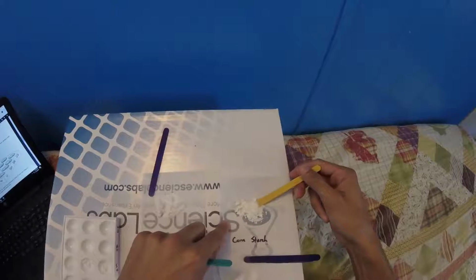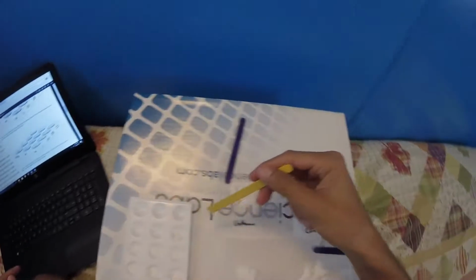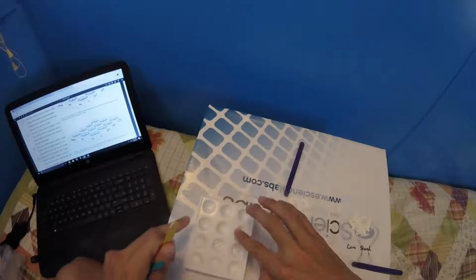Alright, then we take a new wooden scoop and transfer a small amount of the cornstarch. Uh-oh, messed up.